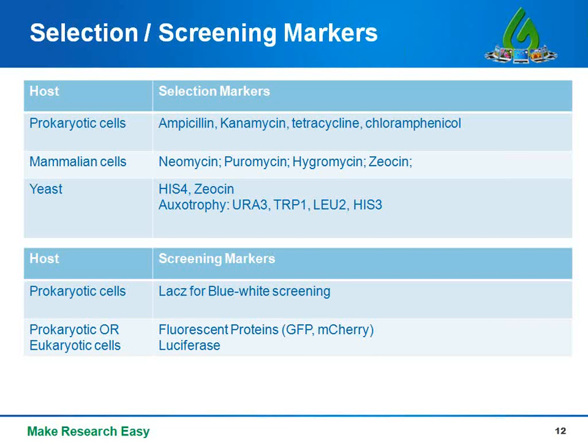So for example, GFP can be used, or a number of other fluorescent proteins, and those can be used not just by looking at colonies by eye under a fluorescent microscope, but also for fluorescence-activated cell sorting to sort of automate the selection or screening process.